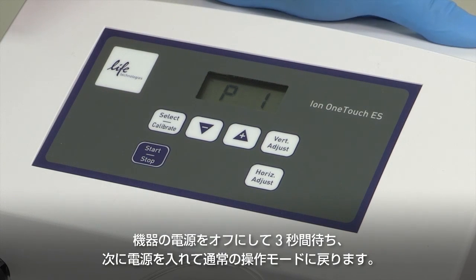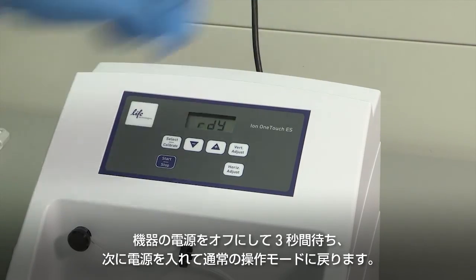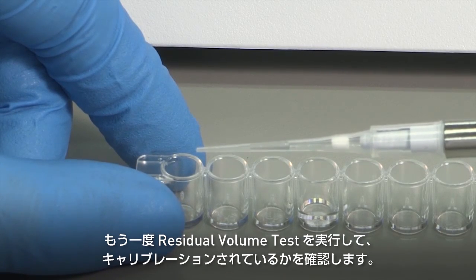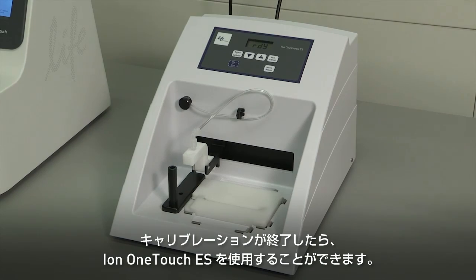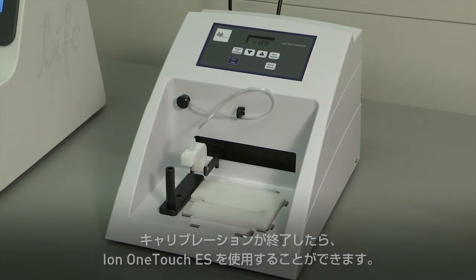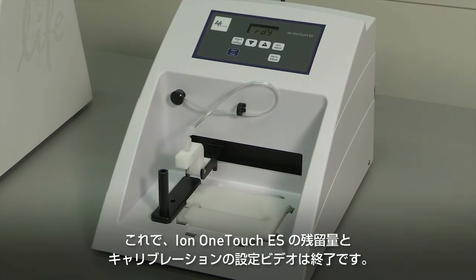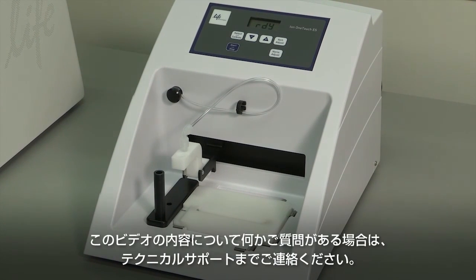Power the instrument off, wait three seconds, then power the instrument on to return to normal operating mode. Once again, perform a residual volume test to confirm the calibration. After calibration, your ION OneTouch instrument is now ready for use. This concludes the ION OneTouch ES Residual Volume and Calibration installation video. If you have any questions about the content discussed in this video, please contact your local technical support team.